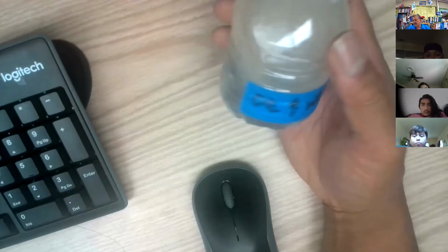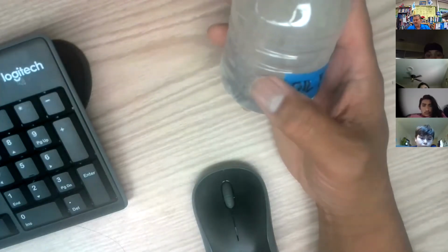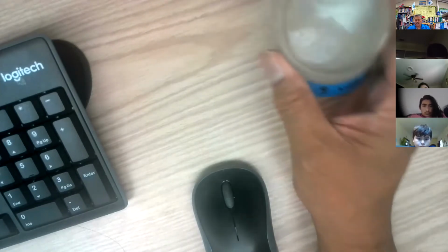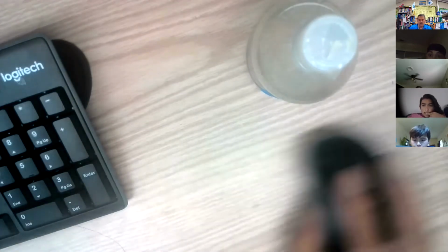And so it's a mixture, but it's not mixing up real well. It keeps coming back out. And so it doesn't look like one homogeneous mixture. It's actually a heterogeneous mixture. So when you go to your chart, you can say mixture. So here's an M. You can say it's an M, but it's not a homogeneous mixture, it's a heterogeneous mixture. Okay, so that's the first one, that's oil.